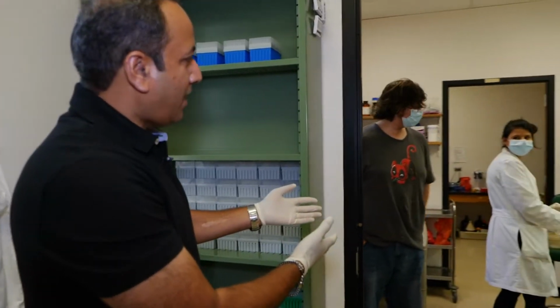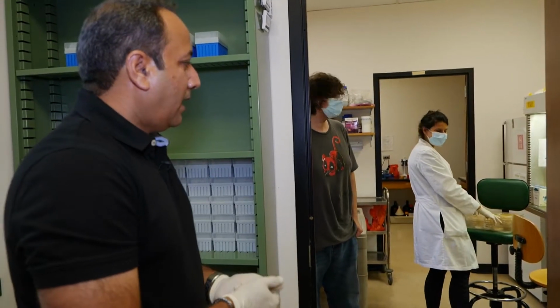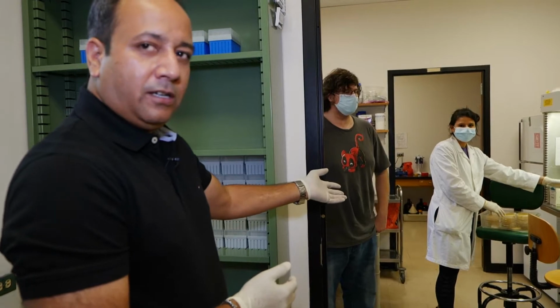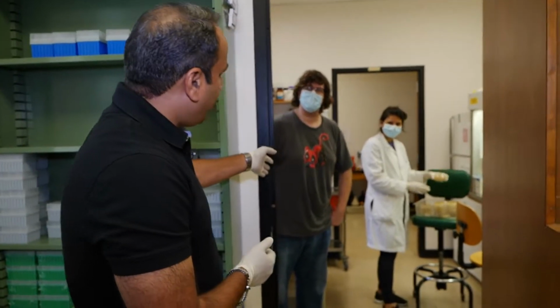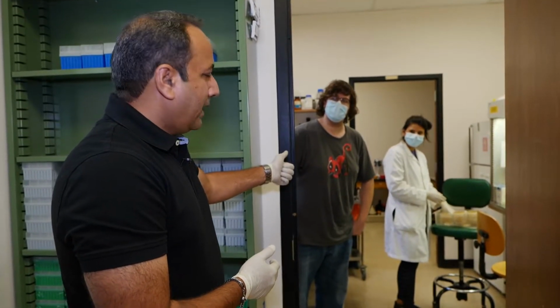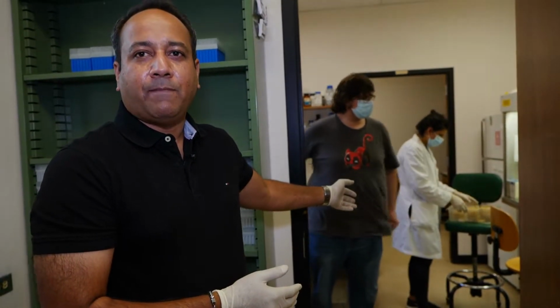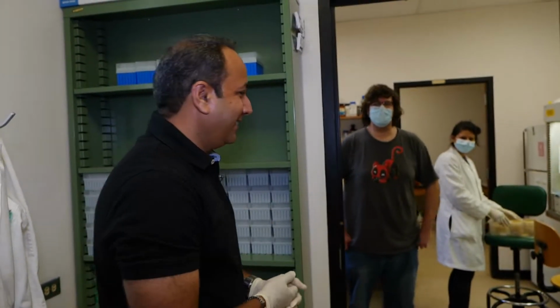So this is my staff here, Mr. Tim Burks and Dr. Monique D'Souza. Dr. D'Souza started working with me last year, and I'm very fortunate to have her. And Mr. Tim Burks over here has been working with me since 2012. He is our lab manager, and he takes care of most of your samples here. I just send you the report, so he's the main man behind the scenes.